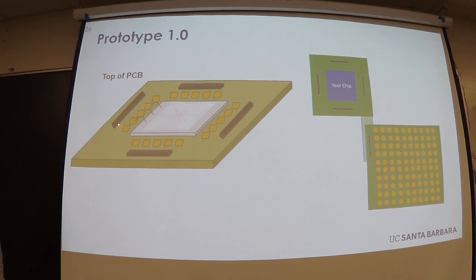And then we have these connectors over here, which correspond to this diagram where you could have this connector attached to this board, and it attaches to this other board where you have BNC cables, and if you wanted to say select an arbitrary electrode, one of these BNC ports corresponds to that electrode. And so you can ostensibly run your experiment this way.